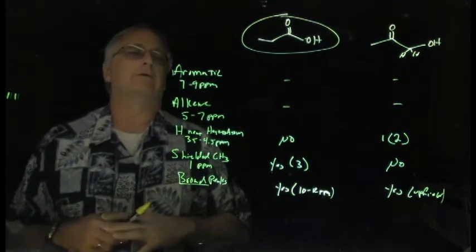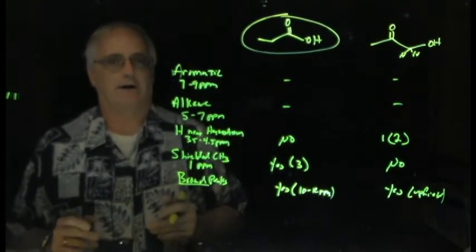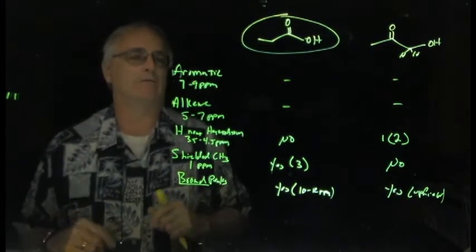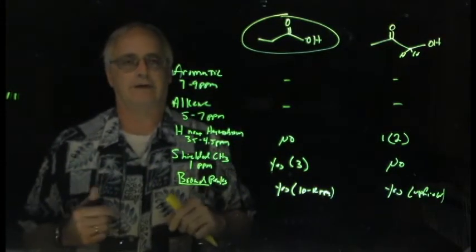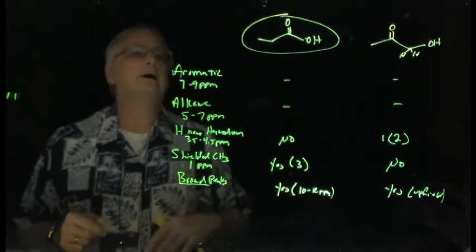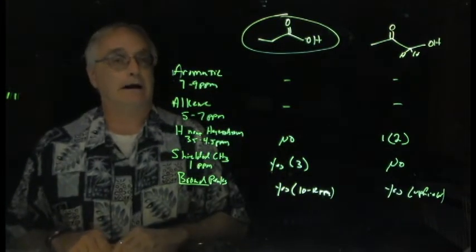Now the last one I have for you is actually a slightly different one. It's a matching exercise where on one page you're going to have 3 hydrogen spectra, compressed a little bit to make them all fit on the page, and 3 molecules, and your goal is to determine which spectrum is molecule 1, which spectrum is molecule 2, and so forth. So again, let me clear the board just a little bit, and we'll tackle that one next.